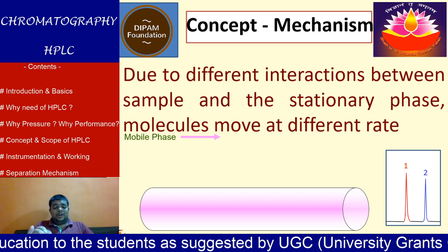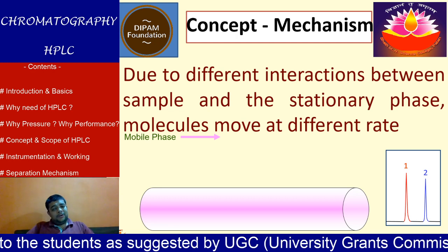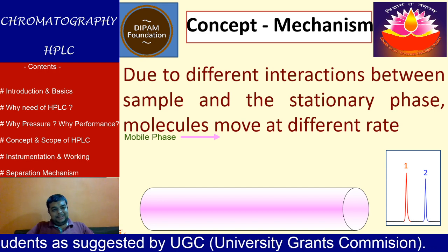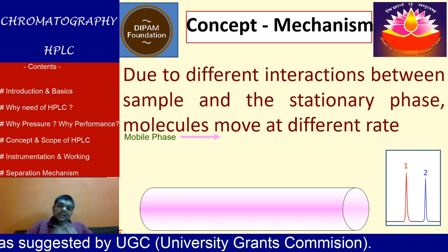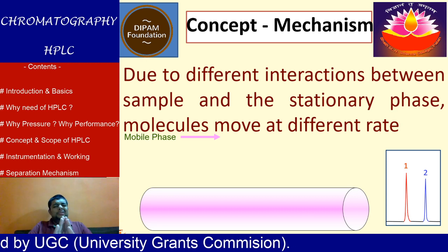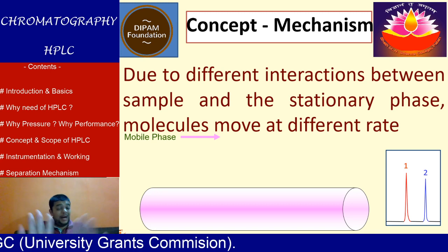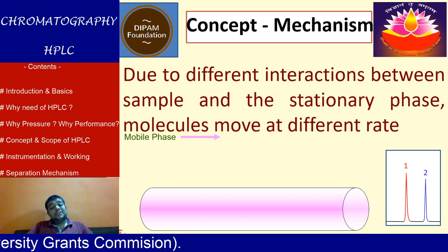But mind well, there is always an interaction between the sample and the mobile phase also. But for this complete set of videos on chromatography, we will keep the mobile phase only as a carrier, and all the answers that we will give or discuss will be based conceptually only on the interactions between the sample and the stationary phase up to this discussion of HPLC on chromatography, which is partially correct, but is the basic which is needed first.